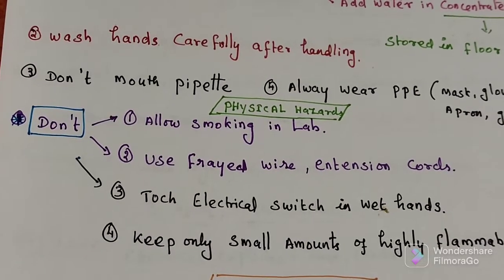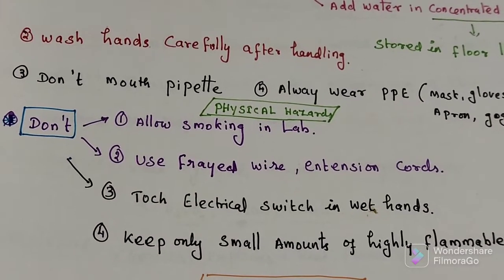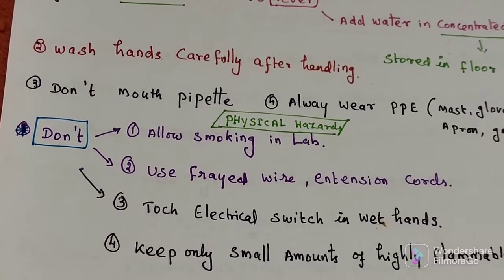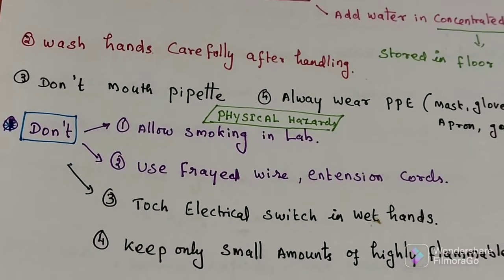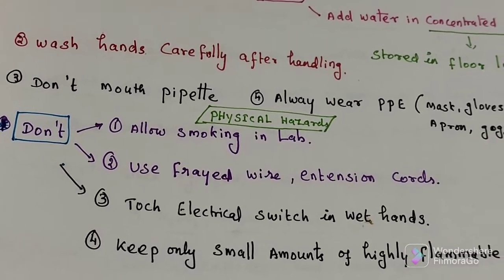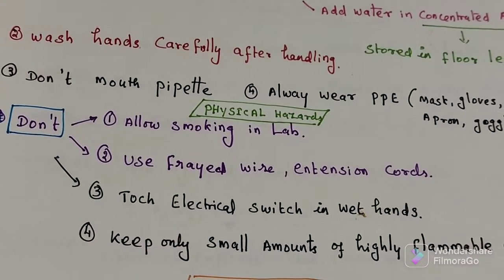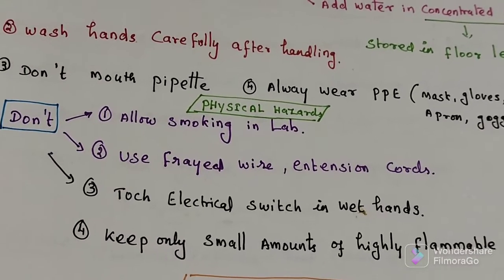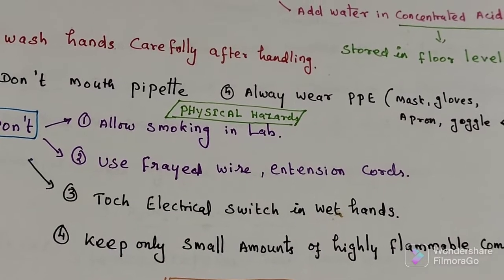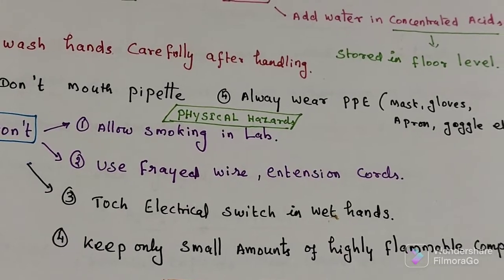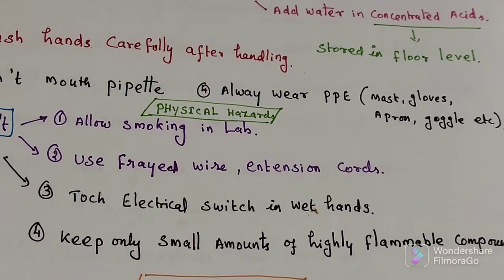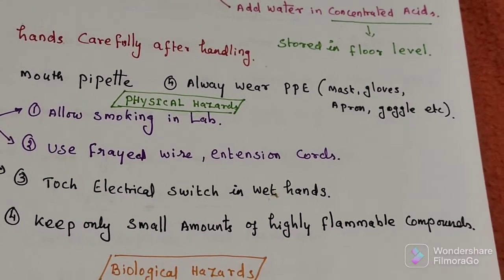Precautions against physical hazards: do not allow smoking in the laboratory. Do not use frayed wire or extension cords. Do not touch electrical switches with wet hands. Keep only small amounts of highly flammable chemicals, to prevent fire hazards in the laboratory.